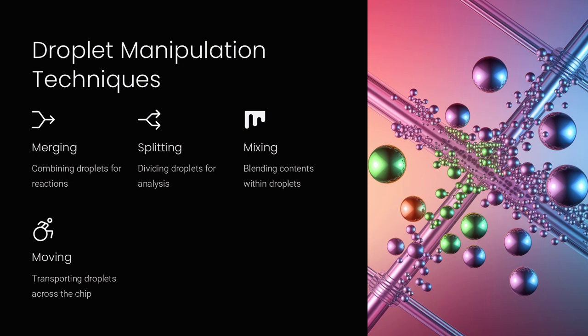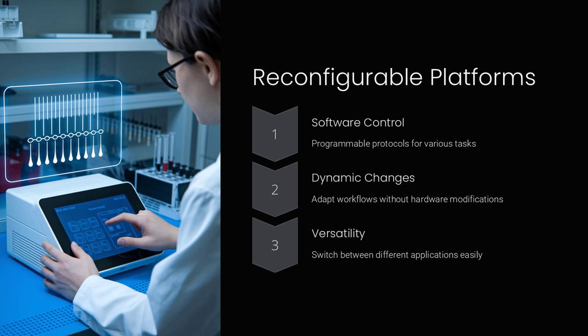Droplet manipulation in digital microfluidics is achieved by applying electrical signals to an array of electrodes. This method controls the movement, merging, splitting, and mixing of discrete liquid droplets by leveraging electro-wetting, where electrical forces change the wetting properties of a surface. Precise control over each droplet is obtained by sequentially activating specific electrodes, enabling complex fluidic operations to be performed with minimal sample volumes.